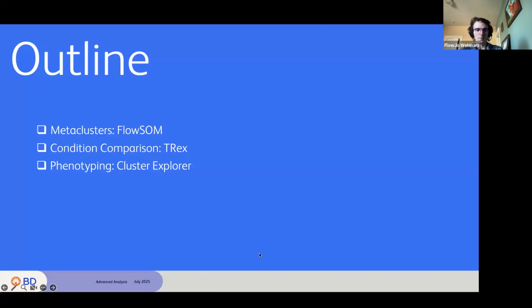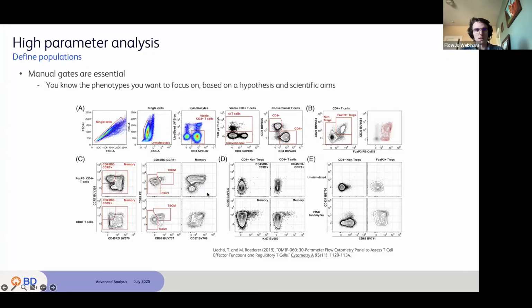And so this is just, again, a brief outline of what we're going to discuss today. I'm going to move through these slides pretty fast, but if I blaze through something in the slides, don't worry, I'm going to do a live demonstration after the slides so we can see it in action. So I'm going to go through the slides kind of quick just to get to that live demo.